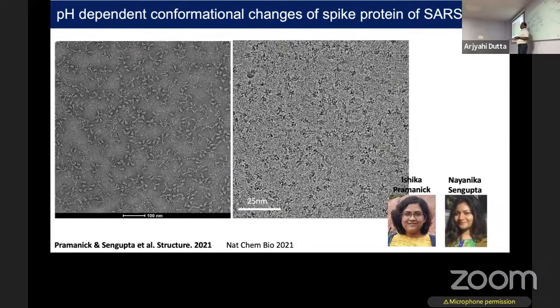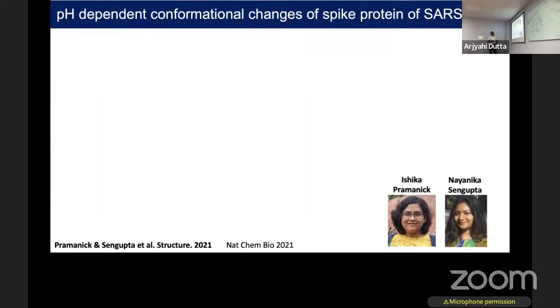In one case we are using staining solution, a heavy metal staining solution. Here we are not using anything, it is in buffer. If you consider buffer or water, your protein molecule is more dense than your buffer. That is why the background is comparatively white and your proteins appear as black, because scattering will be more due to protein. And here it is just the opposite, because of the heavy metal staining solution. That is the reason I put both images side by side, so I can explain that.